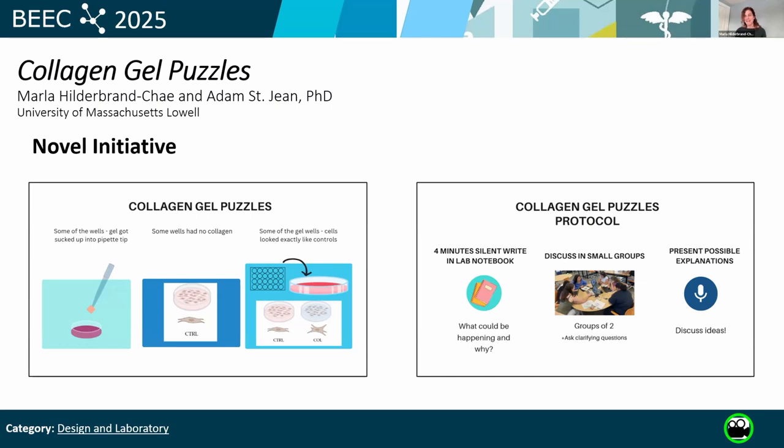However, when I went to fix the cells, I noticed a lot of unusual things happening with the gels. For example, one student's gels got sucked up into my pipette, so they weren't appropriately polymerized. In another case, the student group actually seeded their cells on the opposite end of the 96 well plate. Then they actually created their collagen hydrogels. So it was just cells in media.